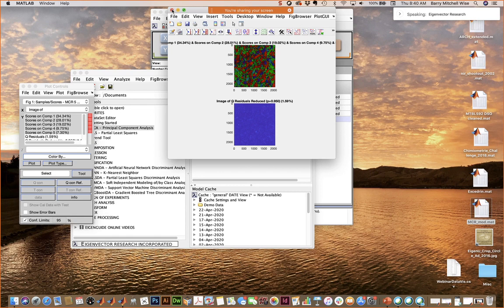Not exactly sure if I understand that. You want to get yourself a list of, say, wavelengths in your spectrometer that are ordered by how big the loading was. Yeah, I think that's something you'd probably have to export them and do a sort on. That isn't one I've ever been asked for.